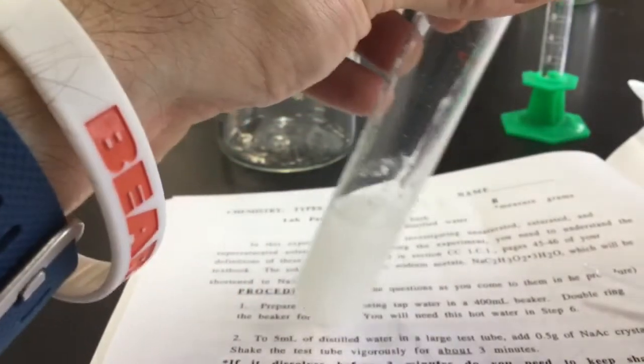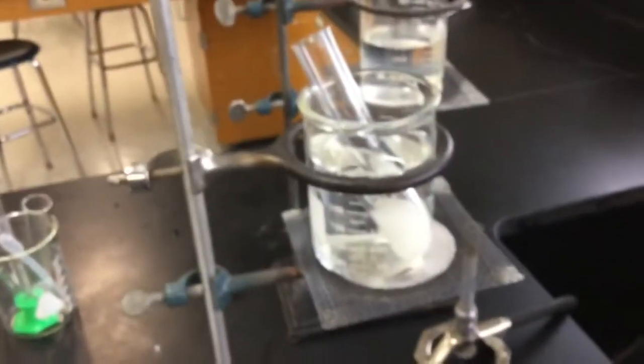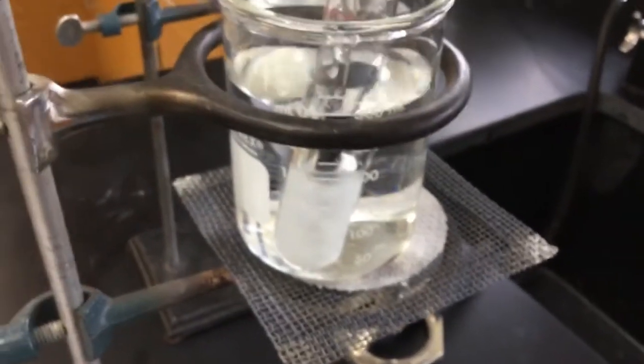Pour the small test tube back into the original. Now you're going to set up your warm water bath to heat this up. When lighting the Bunsen burner, keep it off to the side, watch your long hair and sleeves, and make sure your hair is tied back. Turn on the gas, then at an angle take your flint lighter, strike it to get some sparks, put the flame underneath, and heat up the sodium acetate solution. Use the rubber policeman to stir it until it gets hot and all of it dissolves.